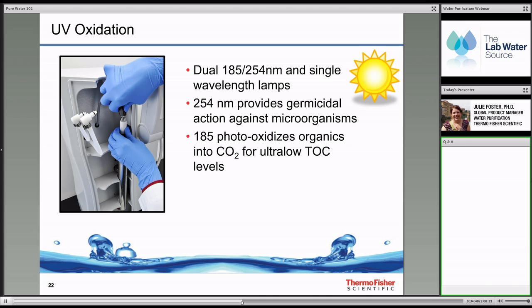The best way always is to make sure that you have a tank that's the right size for your usage. You want to empty that tank every 1 to 2 days. So getting the right tank from the start is the easiest and best way to prevent bacteria growth. If you can't do that, or you want some extra incentive to make sure the water stays clean, a lot of water systems will recirculate tank water. They'll take the water that's in the tank, pull it back into the system, run it through the purification steps, and take it back to the tank.